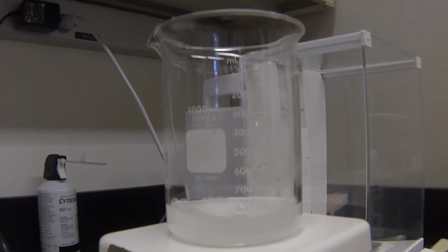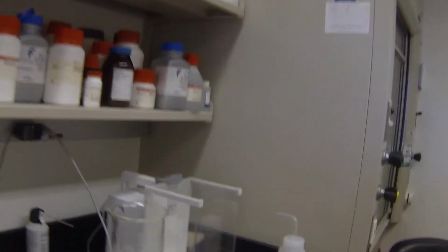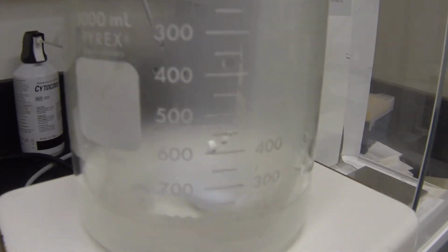All right, so we're just basically going to let this go until the solution turns clear, and then we can bottle our stuff up. So this was basically how we mix in the lab. It's pretty simple. As long as your math is correct and you have everything you need, there's nothing to stop it. Look, now it's turning clear. Perfect.